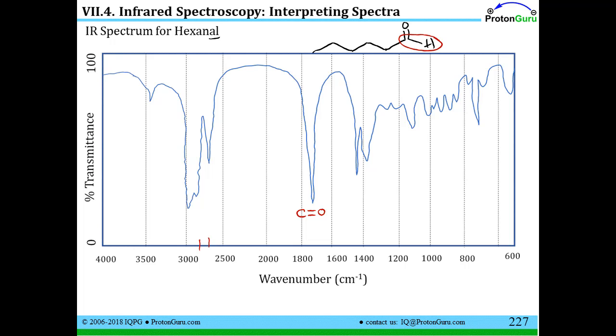Now the 2800 peak, in this case, would be overlapping whatever this large peak is that's not in that region. So although we can only see one of them, we know that there aren't any other species we talk about that has an absorption around 2700. So we can attribute that specifically to the CH stretch of the aldehyde unit.